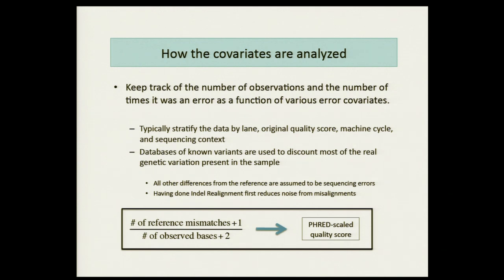Right, so it's interesting. There's actually a lot you can do. So the question is about how you require this dbSNP. What if I'm sequencing in these crazy organisms that don't have dbSNP? What can I do? So we might as well talk about it. There's lots of things you can do. It's very interesting. All you need to do is discount the sites of probable genetic variation, right? So there's lots of strategies. One is you could make an initial round of SNP calling. You could take your data, make an initial round of SNP calling, and just say, I'll take all the SNPs where I'm 99% confident, I'll use those as my database of genetic variation. Because all you want to do is discount the sites that are probably genetically variant, right? So it's very fuzzy because what we're trying to do is just get rid of these crazy systematic biases. We're not trying to be incredibly accurate, we're just trying to get rid of the crazy biases, right? So if you're off by a little bit, it's not a big deal. And I'll show you some examples.